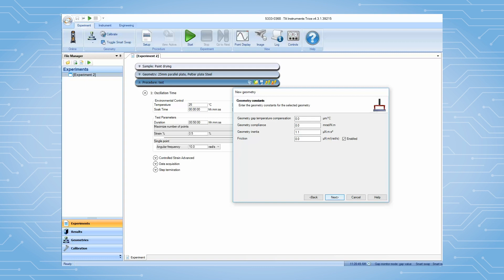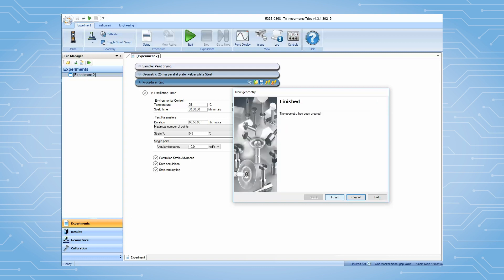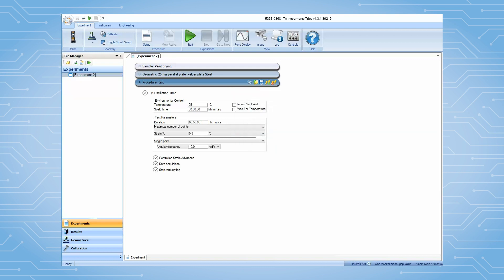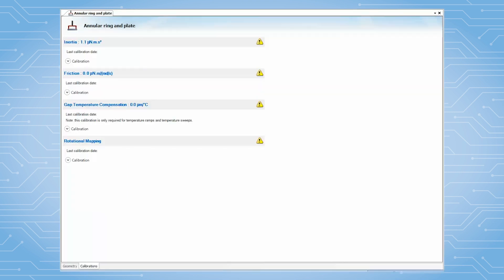Then, TRIO will automatically lead you to perform the geometry calibration. The required geometry calibration includes two steps: inertia and friction. The gap temperature composition and rotational mapping calibrations are optional.